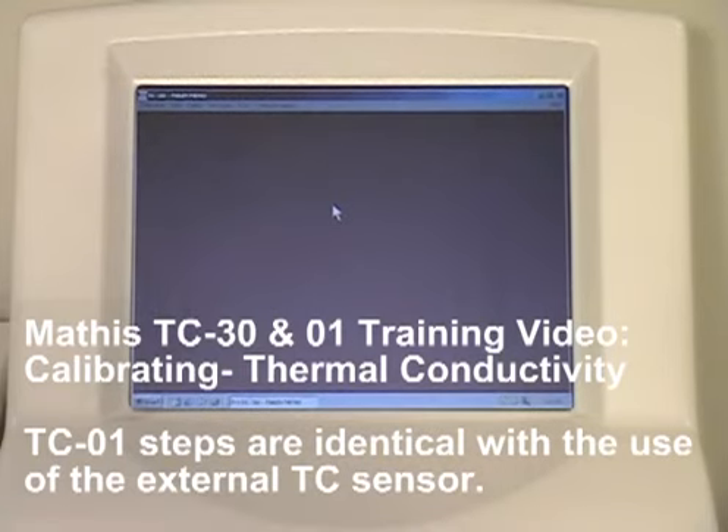In this section of the Mathis TC30 training video, we will cover calibrating for thermal conductivity.